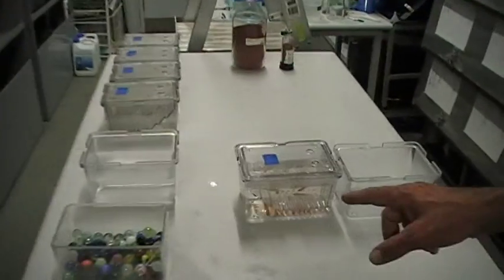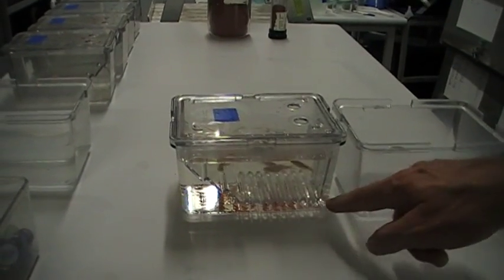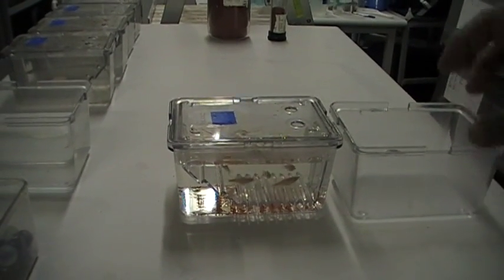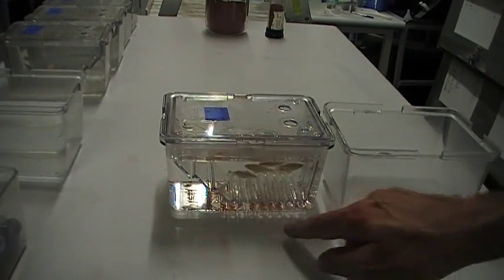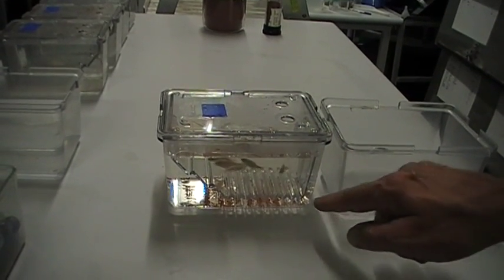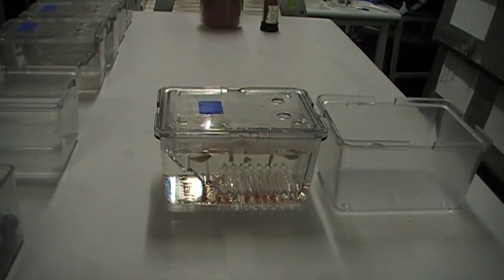And over here we have another system. This is a specially designed tank with slots in the floor and the fish lay their eggs and they fall through the slots and then they collect in the bottom. At the moment you can see the food which we fed the fish earlier that also fell through the slots.